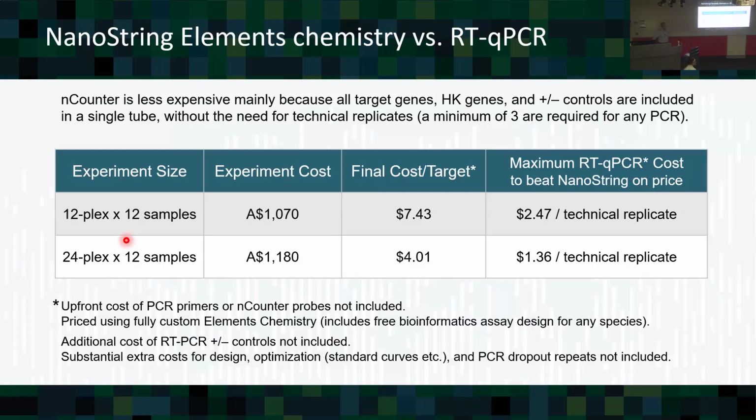Has anyone looked at mixed infections? Yeah, there's been a lot of questions around that. They can design to anything, but bacterial species are kind of a continuum, aren't they? They blend one into the other. People have wanted to do environmental screening to look at the health of soil and things like that, and you're probably best to use sequencing because you're not making any prior assumptions. This is a validation technology. You have to know your target, basically. But if you do know your targets, yeah, perfect.